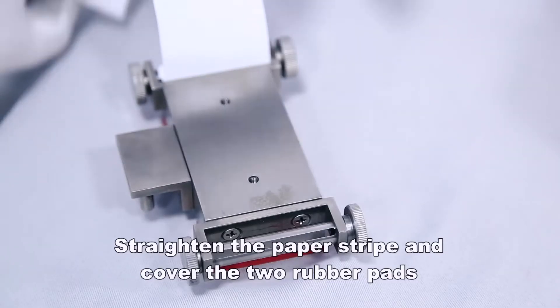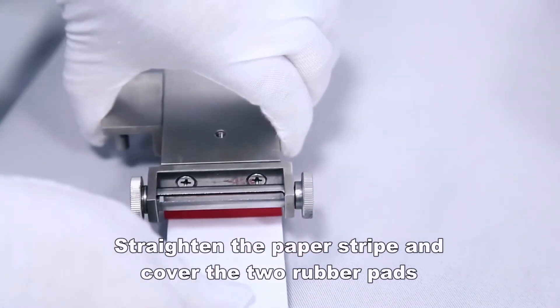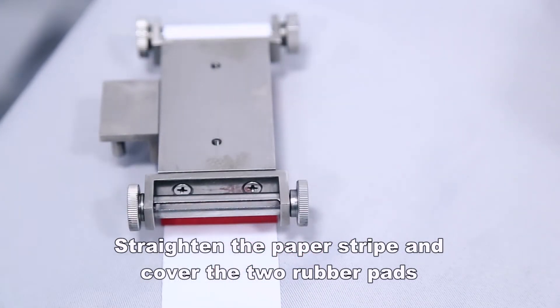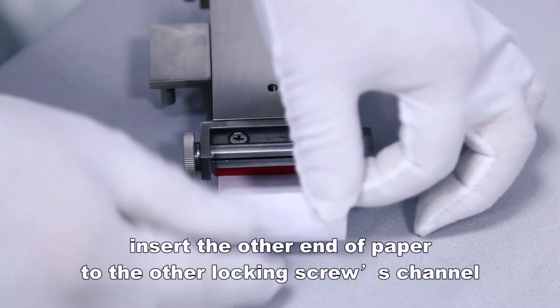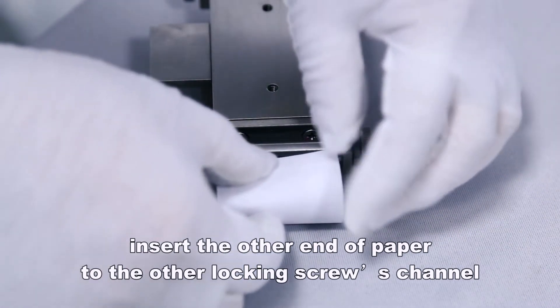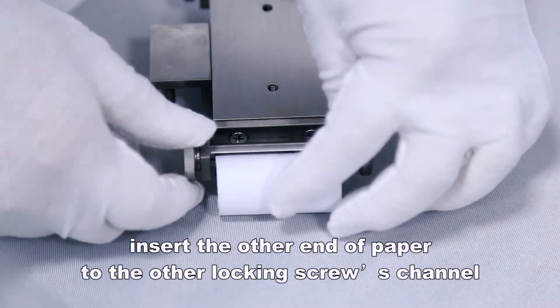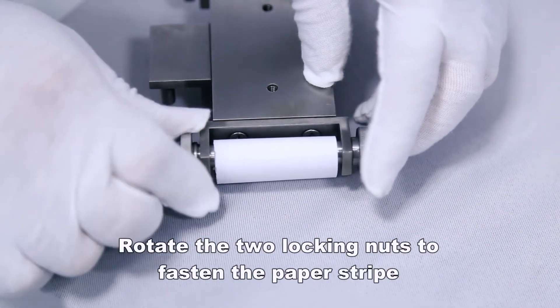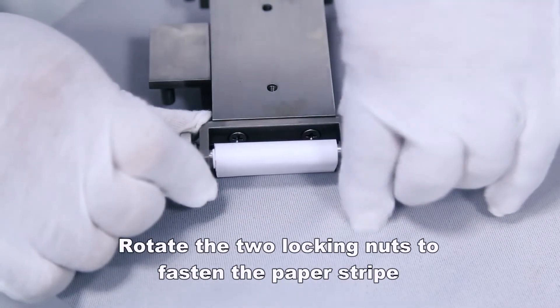Straighten the paper stripe and cover the two rubber pads. Insert the other end of paper to the other locking screws channel. Rotate the two locking nuts to fasten the paper stripe.